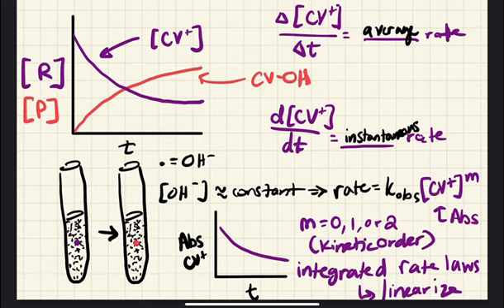So we'll measure the absorbance of crystal violet, and let's recall that there are 3 possible kinetic orders for a crystal violet reactant. It could be a 0, a 1, or a 2. And so based on the shape of the curve that we obtain when we take measurements of the absorbance over time, we can determine what that kinetic order is.